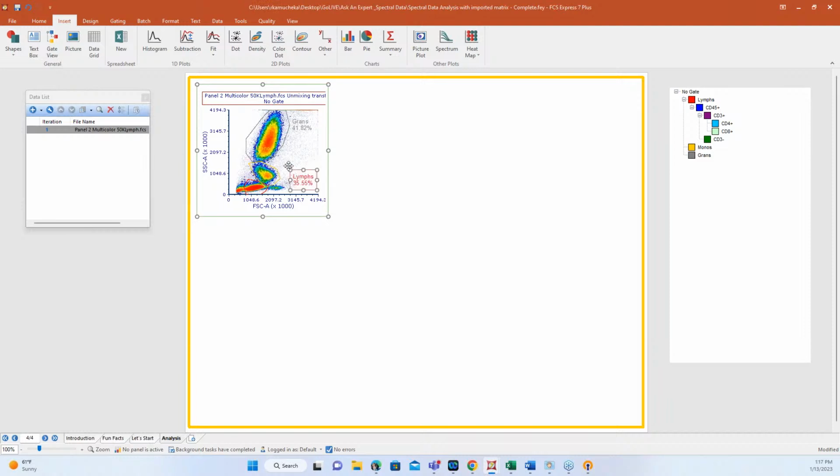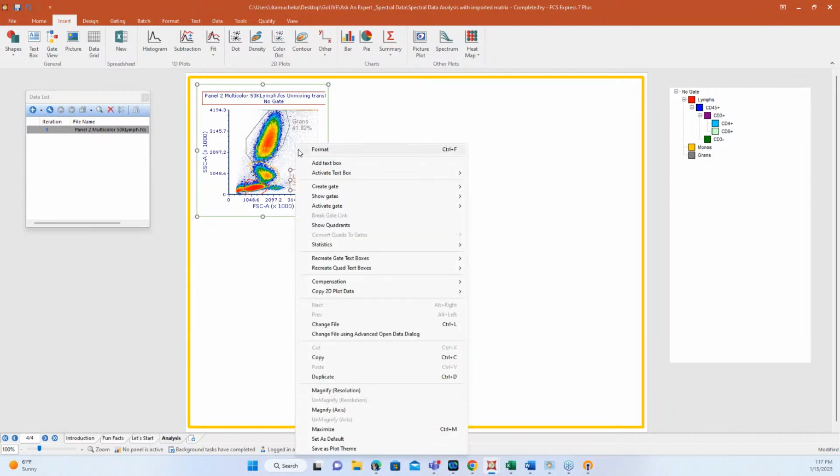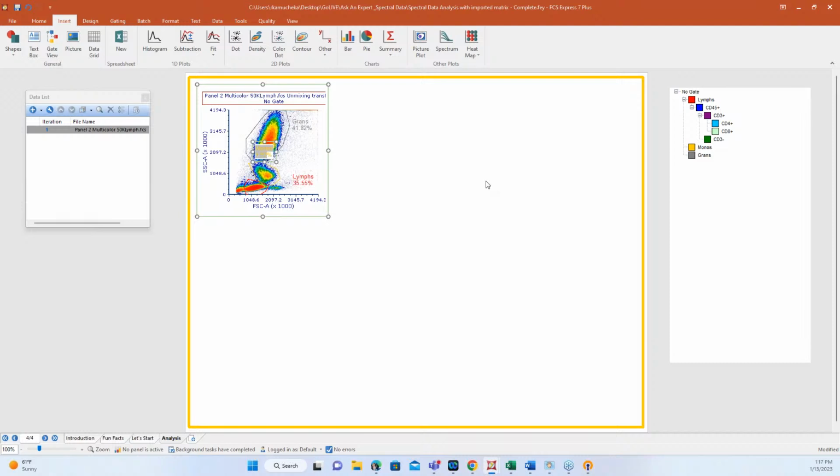Now, this monos gate, as you can see, has gotten tucked under our grans gate. We have this great new feature to activate a text box. Let me see if I can find it. There we go. Sometimes it's hard to choose which one because they're numbered, but if you just choose one of them, it will highlight it so that you don't have to move the gate or make any other adjustments. I can now just grab that text box and pull it over. It gives you the flexibility to get to gates or text boxes that have gotten trapped behind other pieces without having to move everything else around.